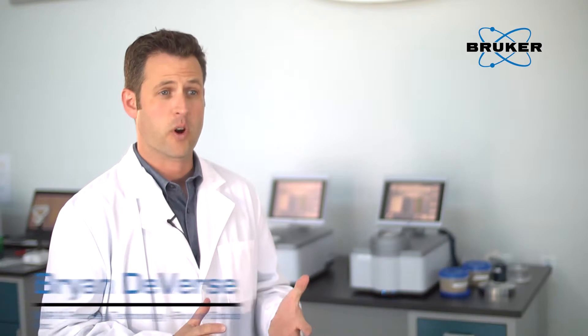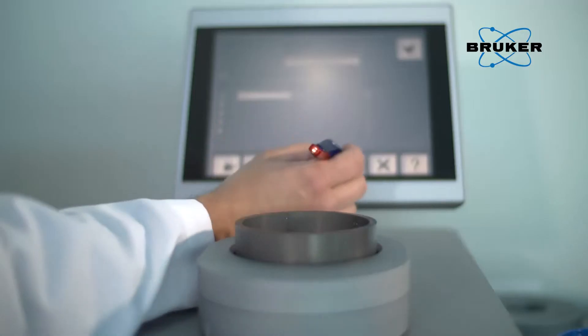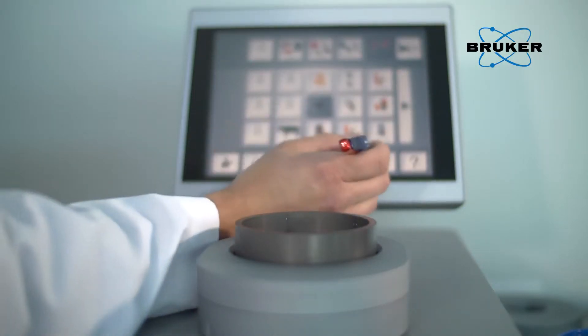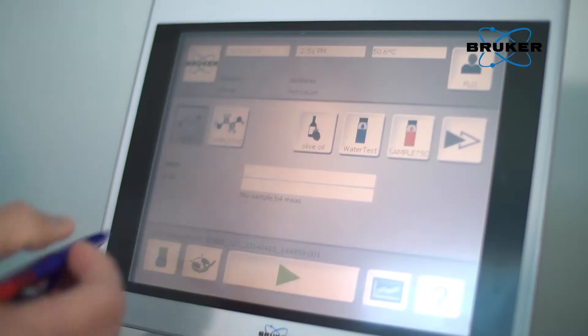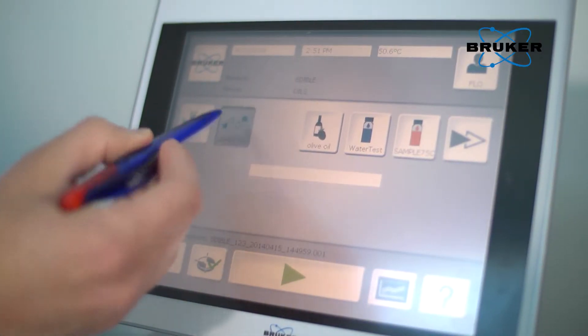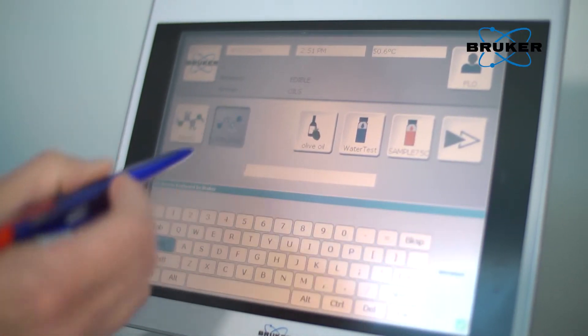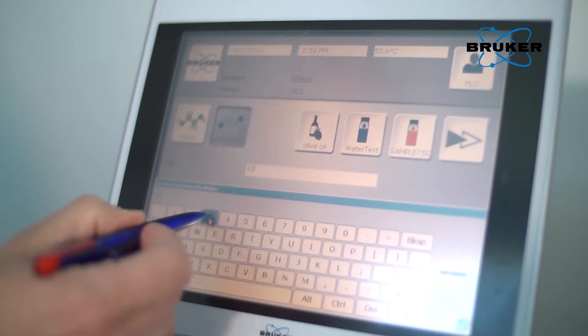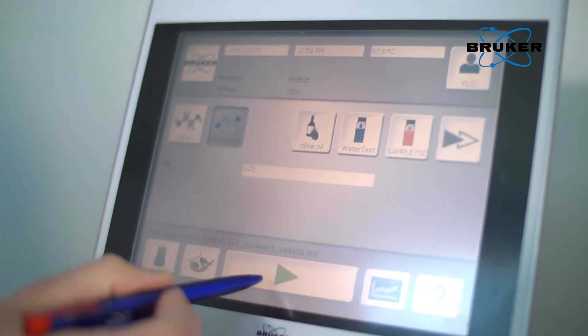The Tango software is a very powerful tool and yet it was designed to be extremely easy to use, making it ideal for quality control operations. The experience with the Tango software is similar to that one that you would have with a modern tablet. Everything is icon-based, making it easy to identify the material that you want to analyze and simply touching the icon of interest and making a measurement.